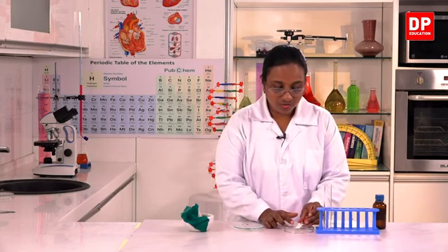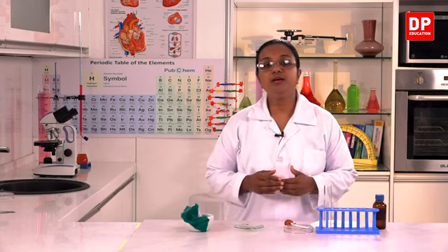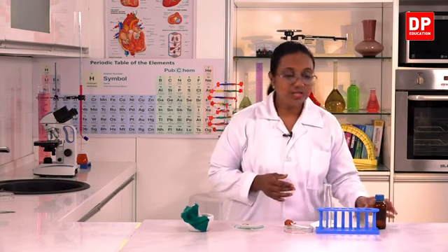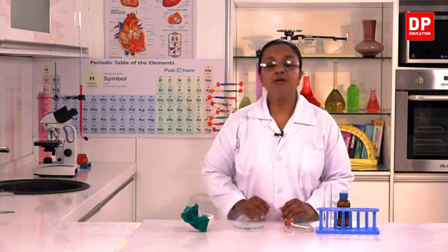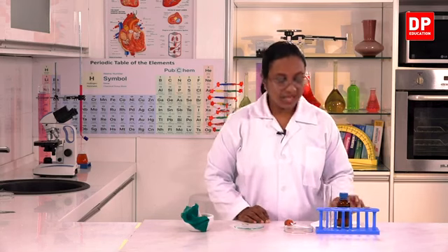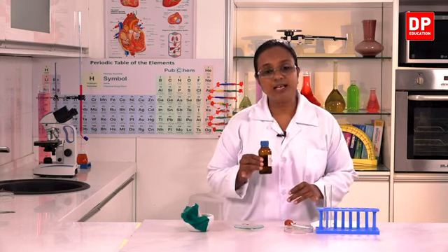Now, as you know, students, chromatography depends on a mobile phase, a solvent, which moves along the stationary phase. Here we have the stationary phase, that is the chromatography paper or the blotting paper. And I am going to use acetone as the mobile phase.